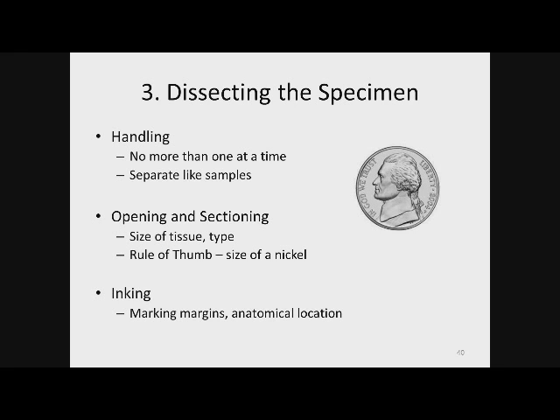And then in dissecting the specimen, in order to keep track of what specimen came from what section, that also will involve inking of the margins to keep that anatomic location in place while we're dissecting the specimen.